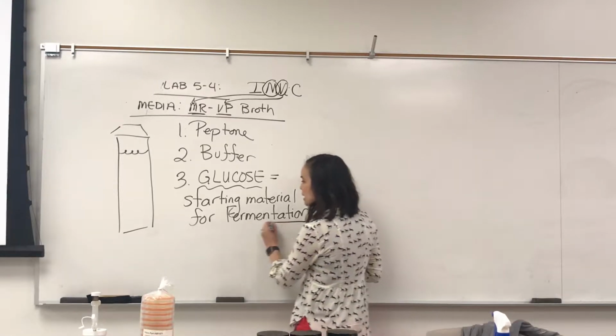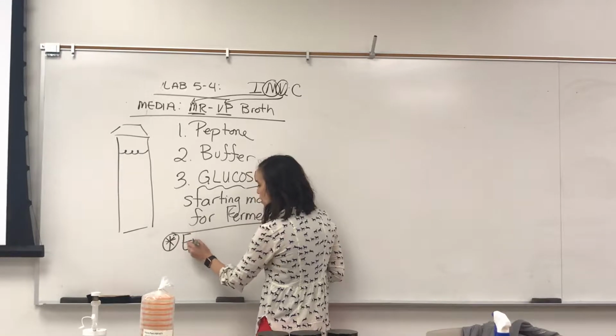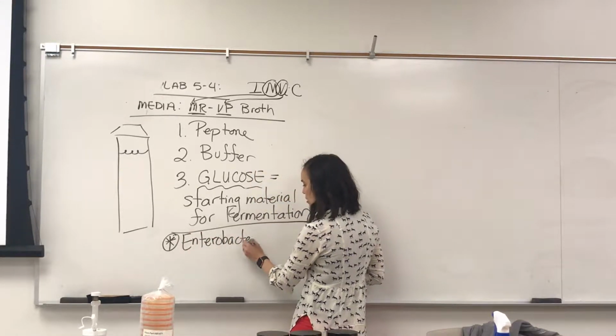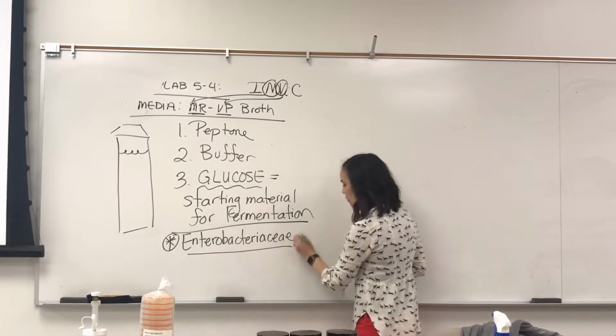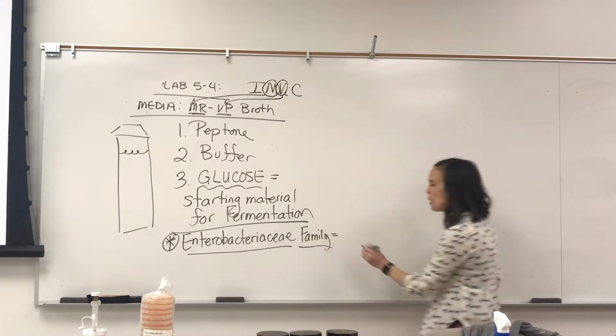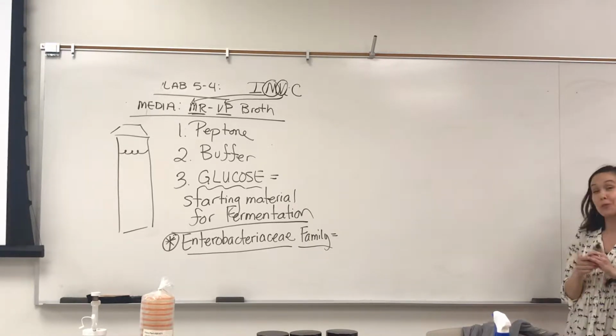One thing to keep in mind, I think we said it a long time ago, so I'll just put it on the bottom. If you are in that Enterobacteriaceae family, does anybody remember, are they positive or negative for glucose fermentation? If you're in the family, you're positive or negative? Does anybody remember?